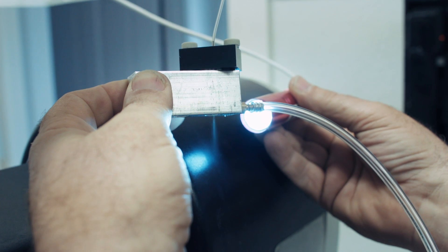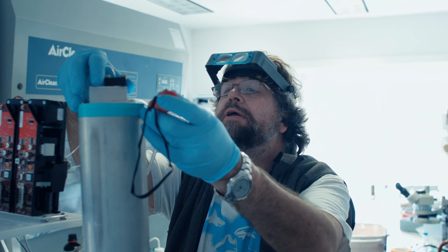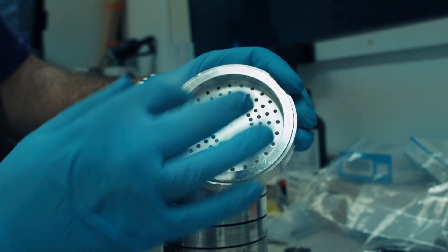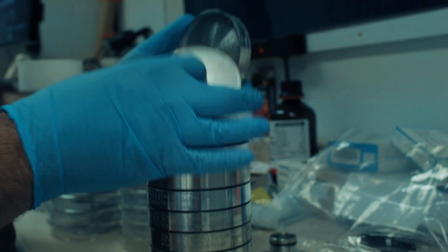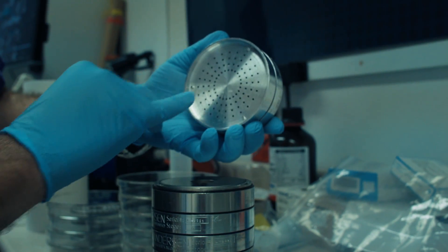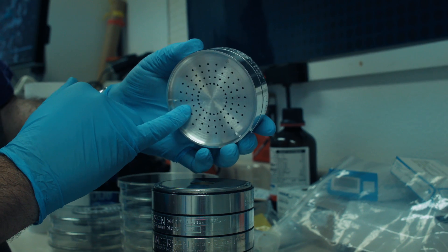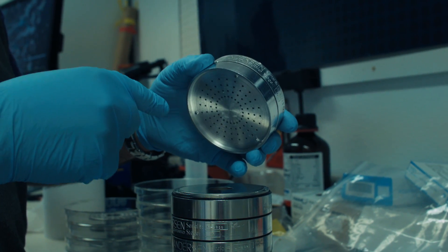From here, putting it through the correct flow rate and the correct air, we make micron-sized particles — 9, 10 micron — and that's what we're collecting on the cascade impactor. You've got this sieve plate and an impaction plate that sits right behind it. As you go further down, the sieves get finer, so the velocity gets higher. The size collected on that stage is smaller as the velocity gets higher.